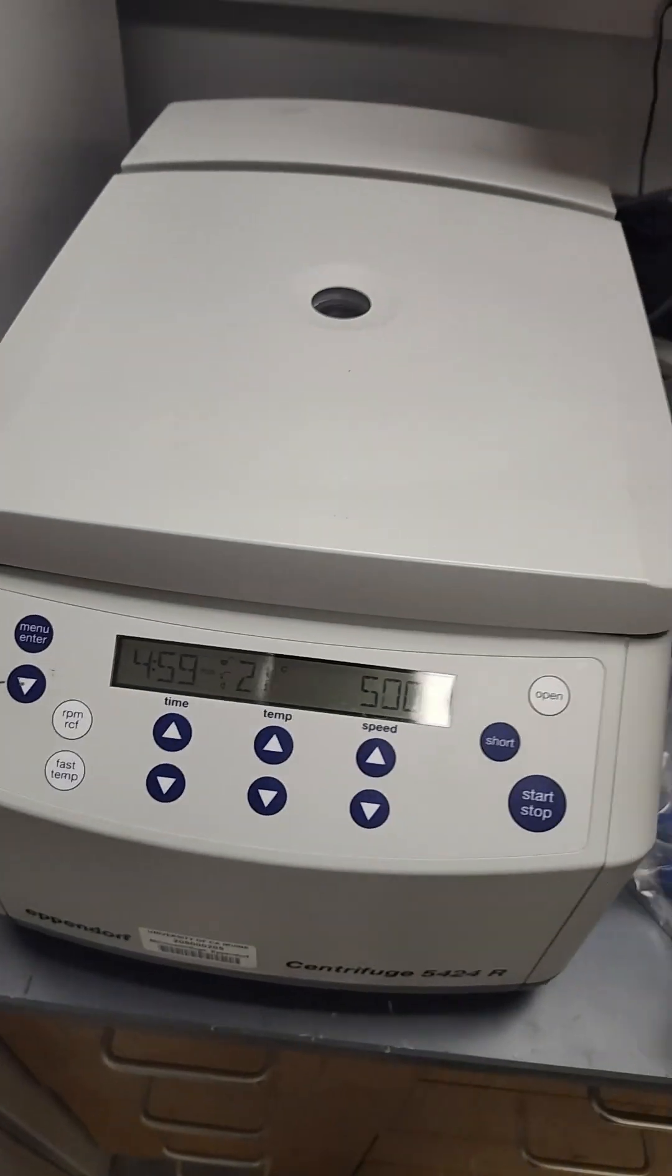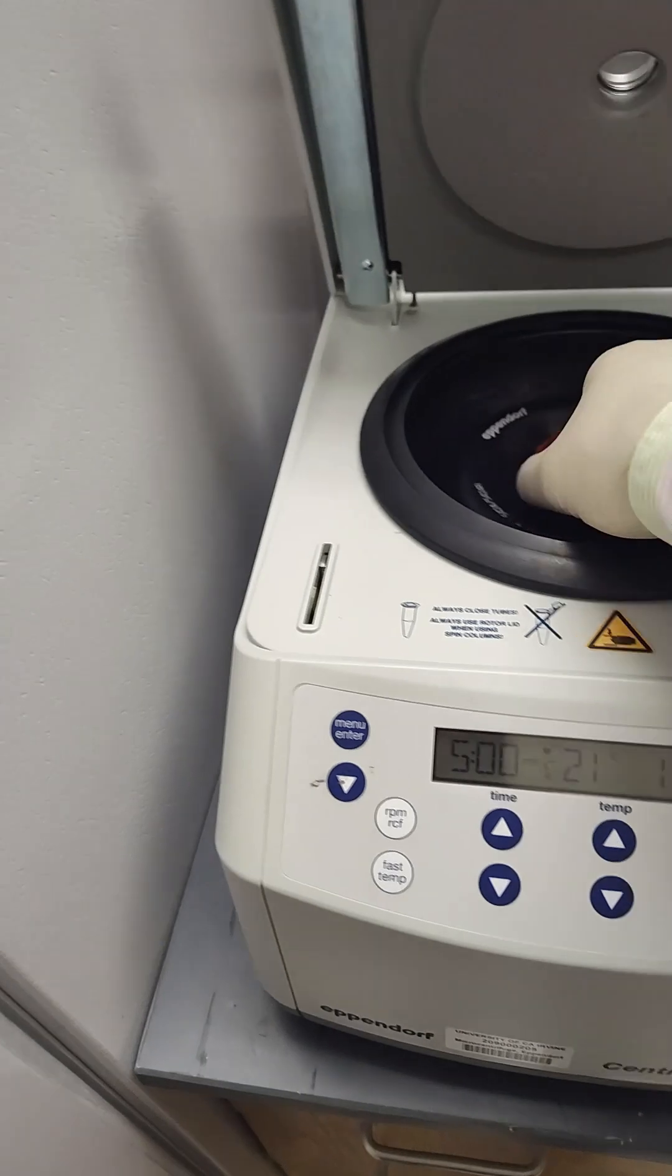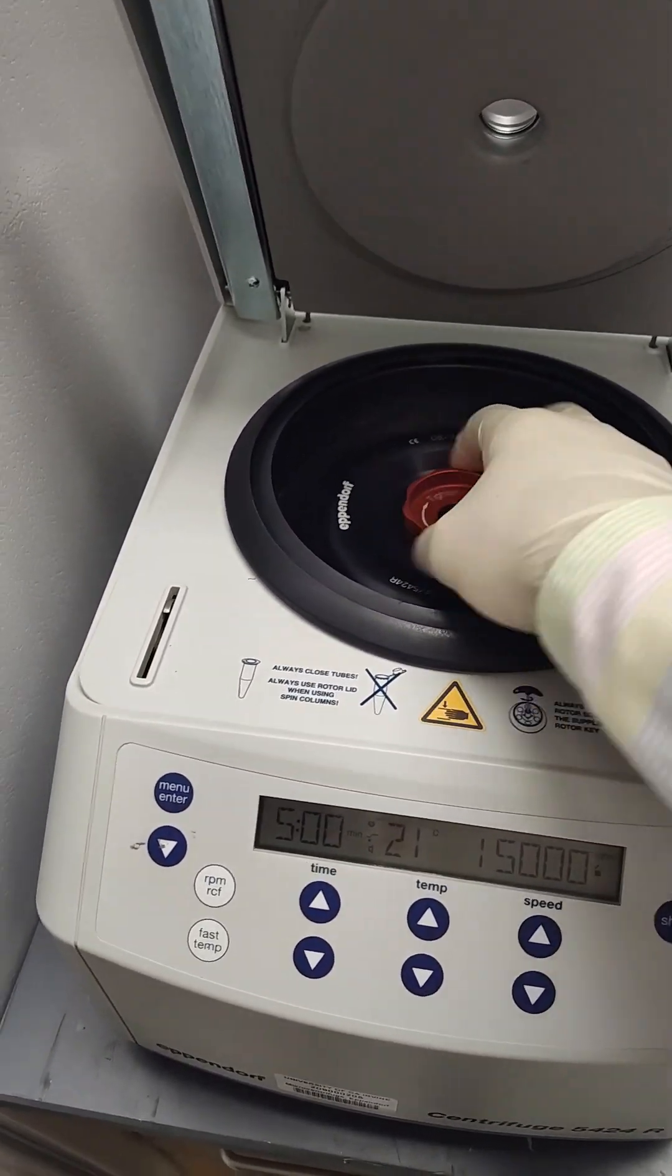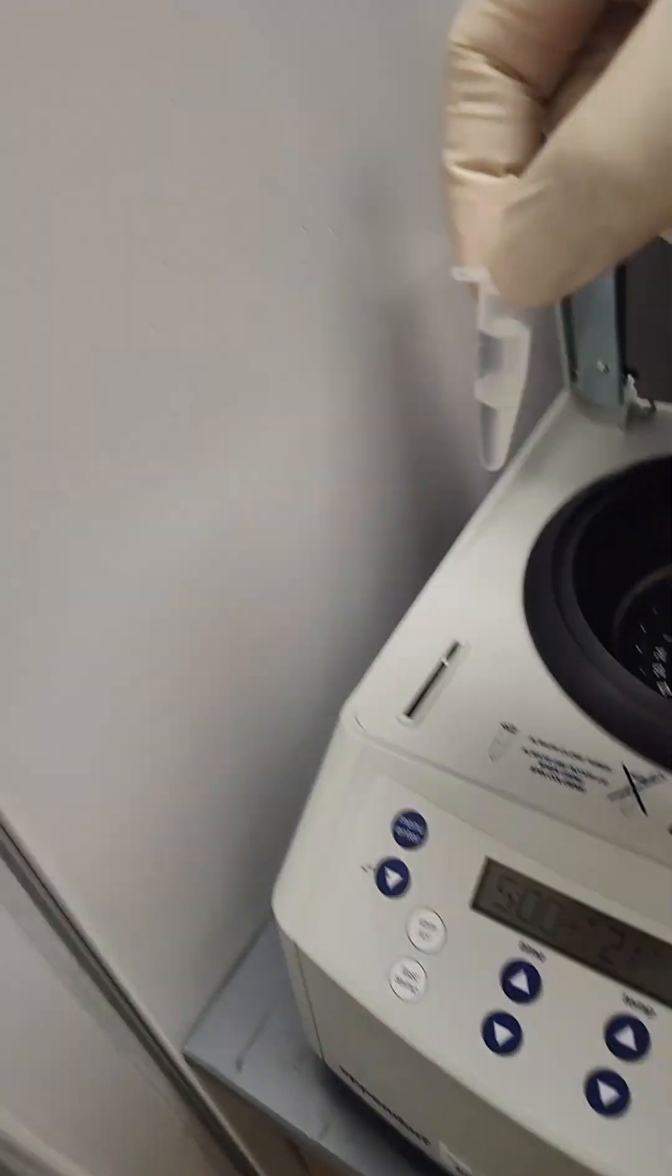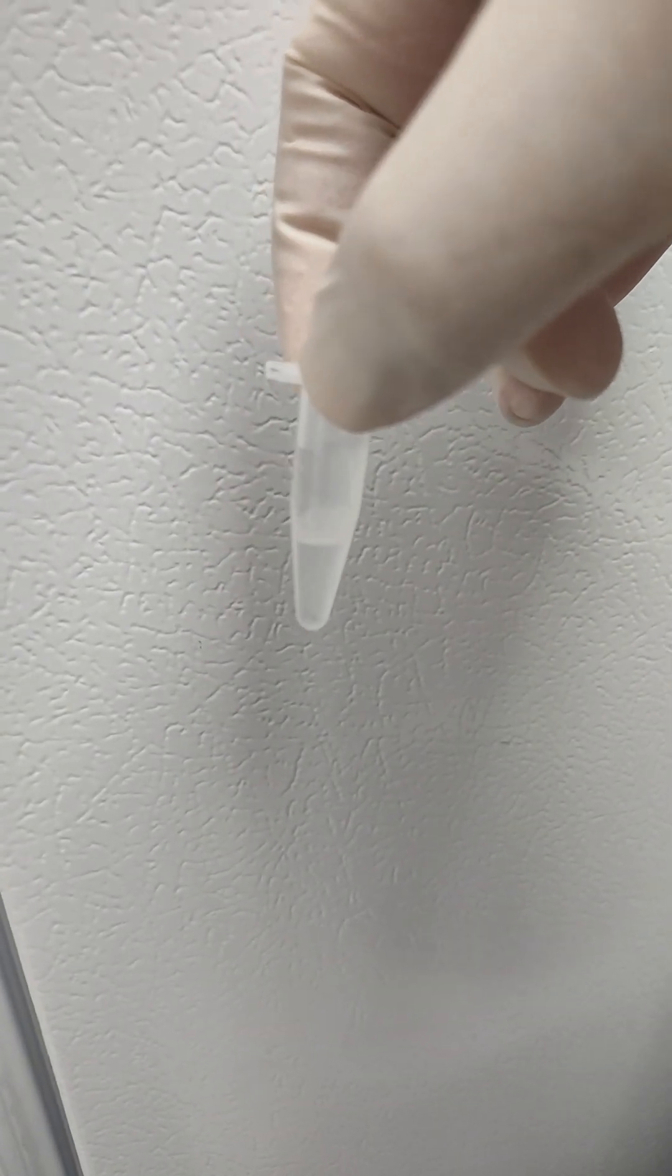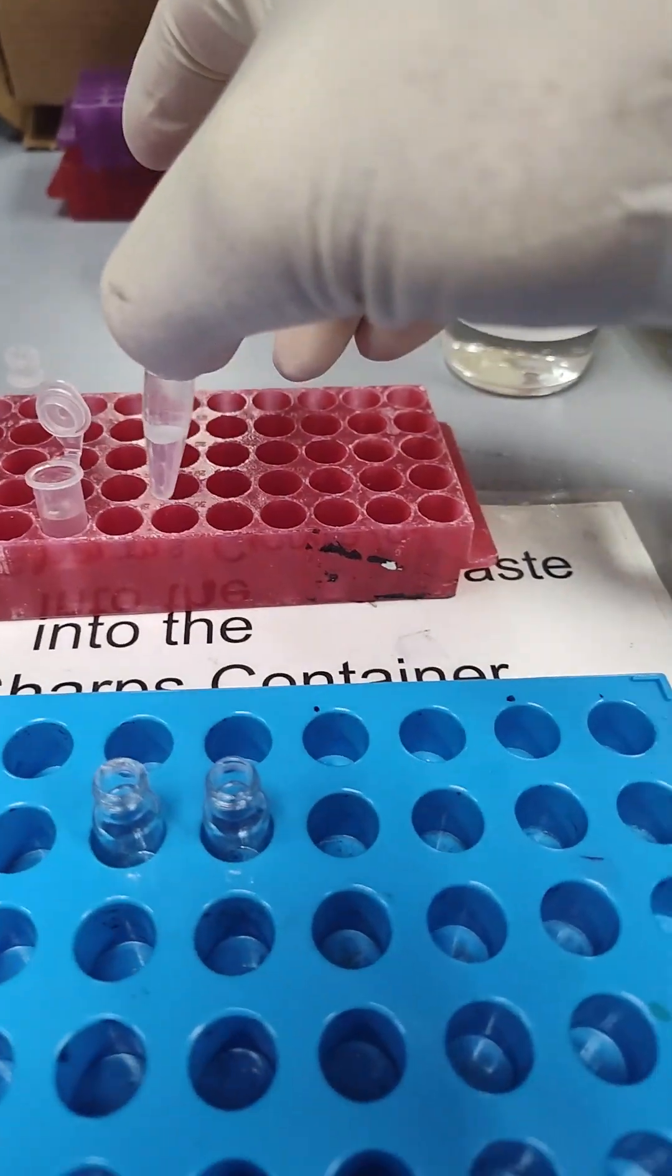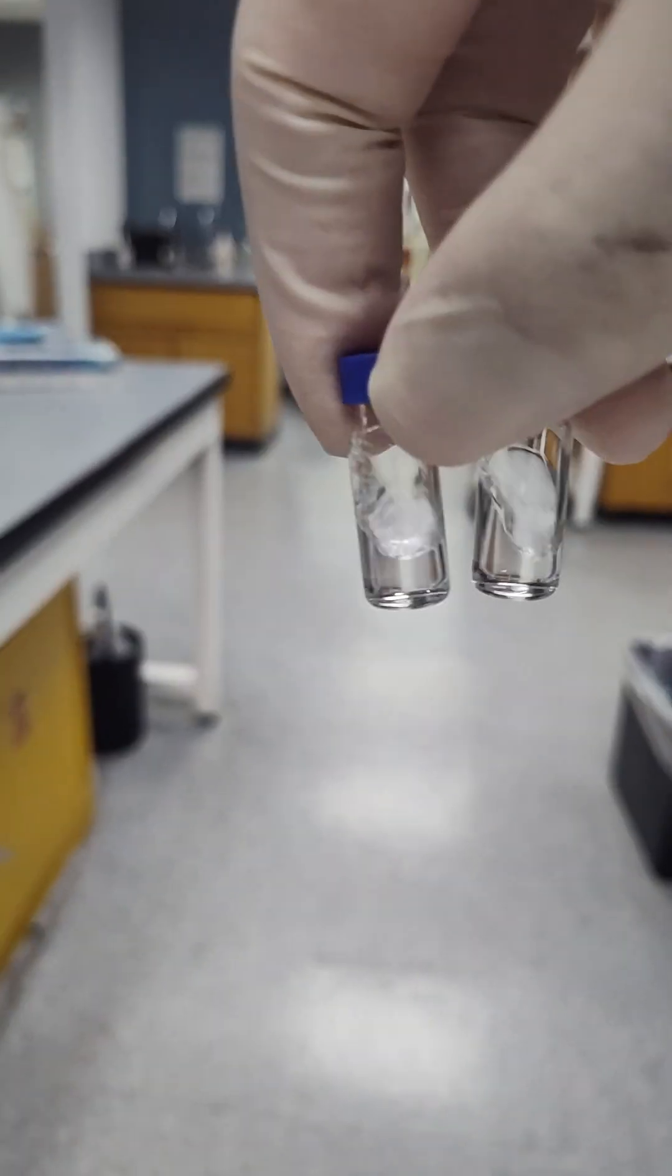Boom, boom on the centrifuge. All right, we go. Hopefully these guys split out real nice. That's good split, not much interface. I mean there's some, but it looks pretty typical. Now we're just going to pull the bottom layer of DCM and then dilute it out in the tube. There they are.